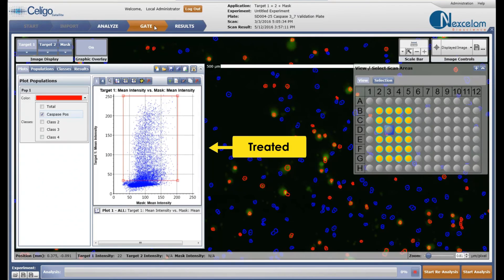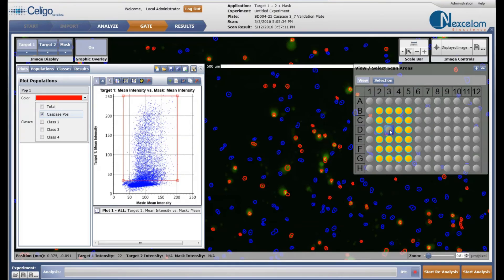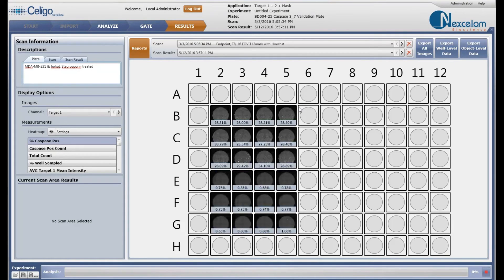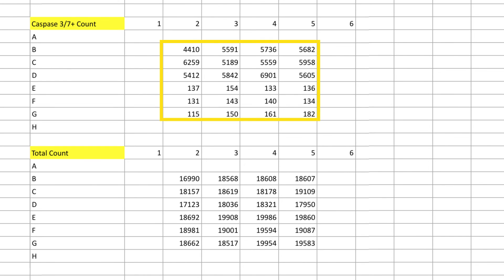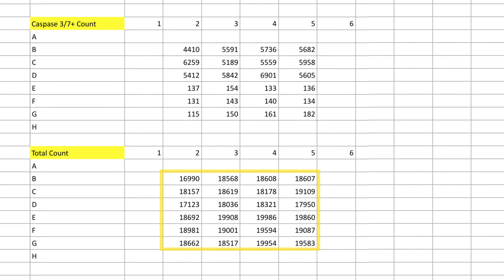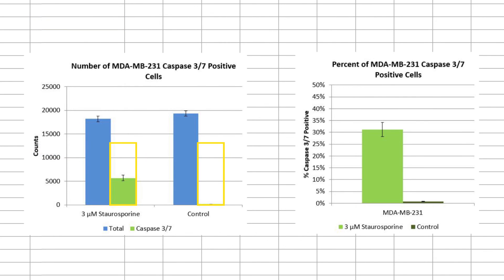The Celigo built-in gating interface provides the necessary tools for plotting and analyzing 2D scatter plots. Optimized settings are then automatically applied to the entire plate for easy data analysis. All the data can be exported to Excel as a CSV file in plate-based layout. Each Excel file contains the number of caspase 3-7 and Hoechst-positive cells as well as percent of apoptosis. Generated bar graphs show an increased number of caspase 3-7-positive cells and percent apoptosis in the staurosporine-treated samples.